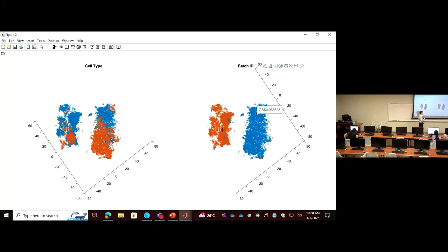Each sample contains fibroblasts and stellate cells. So we need to decide. We are going to do fibroblasts, okay, the DV analysis.